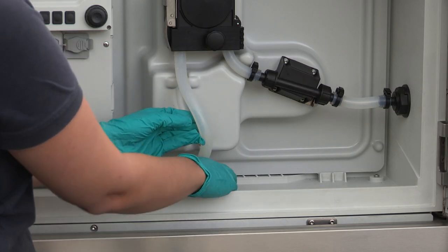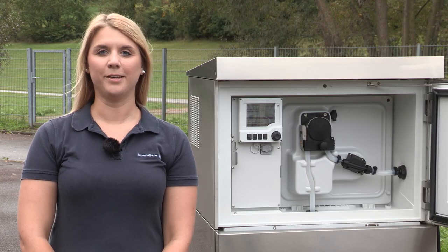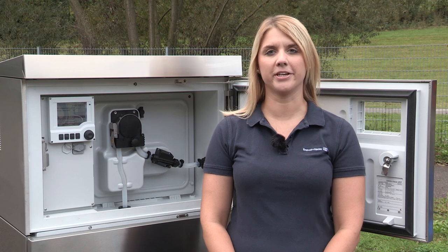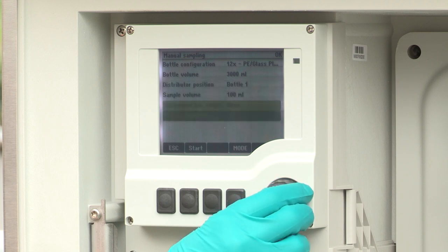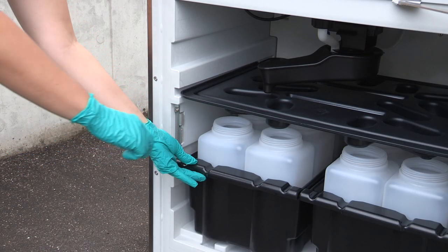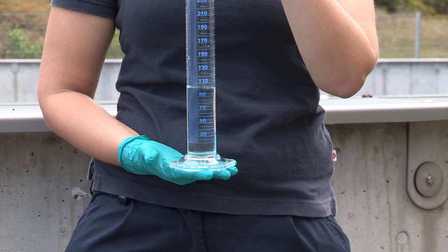Then guide the inclined end of the pump hose into the hole in the bottom of the upper compartment. Now all calibration steps are completed. Perform a manual sampling to confirm the proper operation of the sampler. Press the soft key MAN, set the sampling volume and a bottle, and then select start sampling. Check if the sample was filled in the right bottle and verify the volume of the sample with the measuring cylinder.